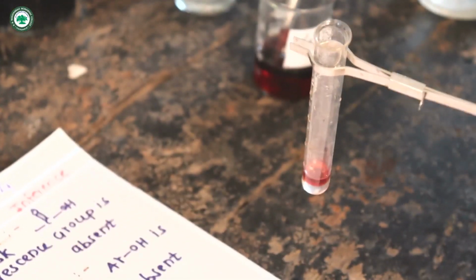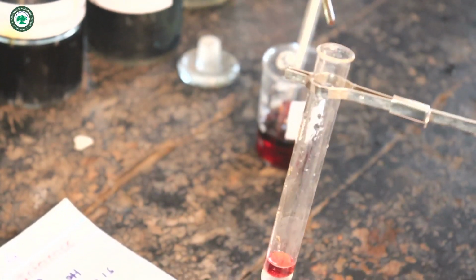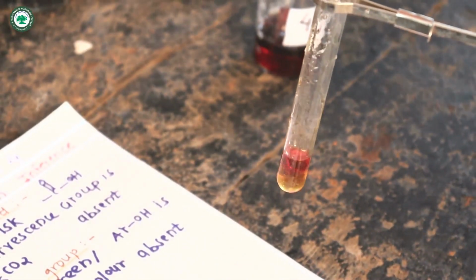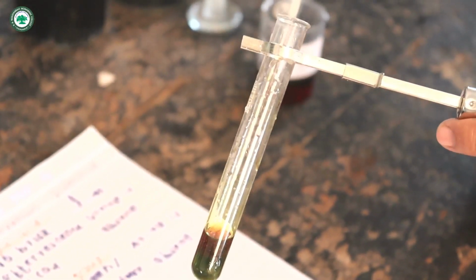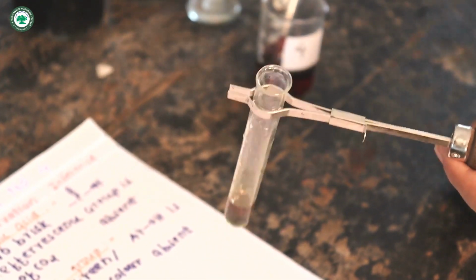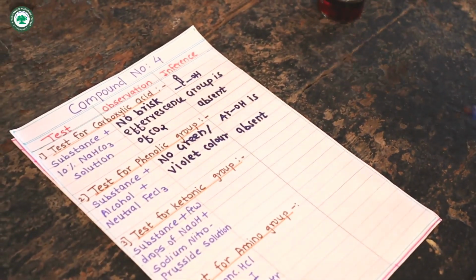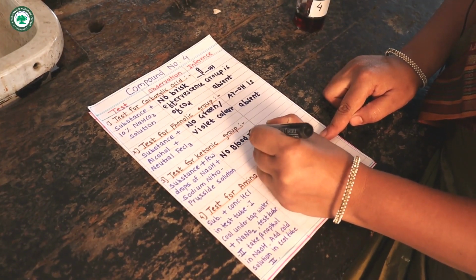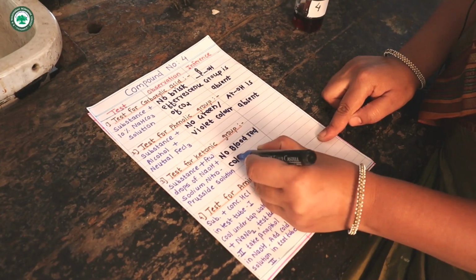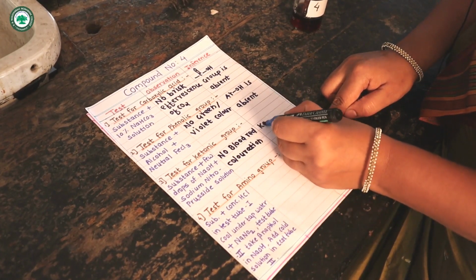Then add sodium nitroprusside. No blood red color is observed, therefore ketonic group is absent. No blood red color. Ketonic group is absent.